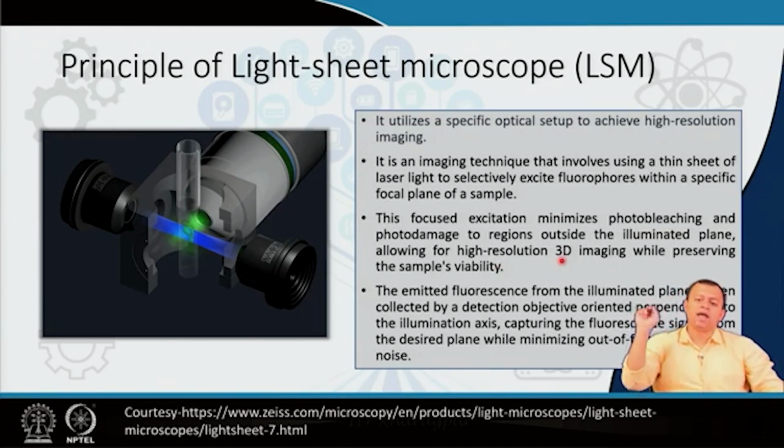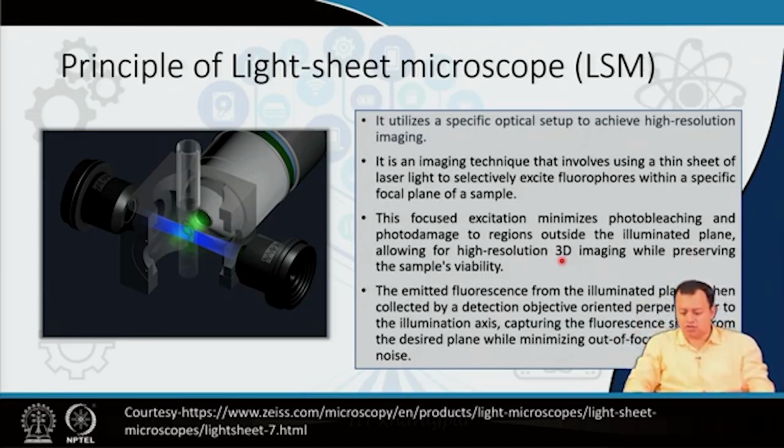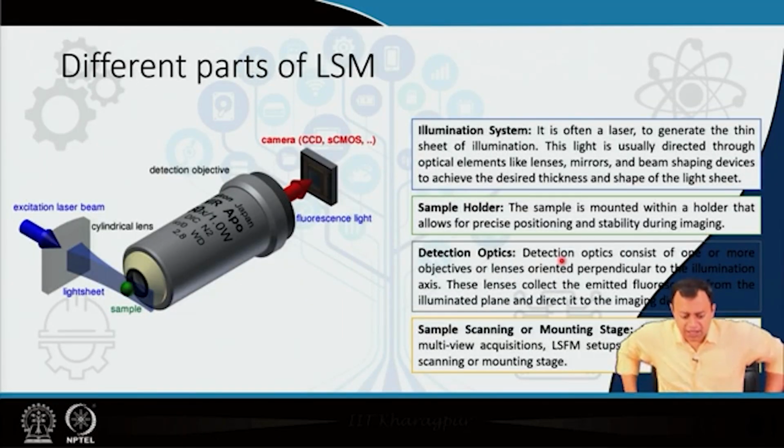You are not imaging pixel by pixel, you are simply scanning plane by plane. Instead of using pixels, you are sending a plane, a sample is getting dissected by light, not literal dissection. You simply are illuminating it plane by plane and measuring it from side to side. So, this is something that is happening.